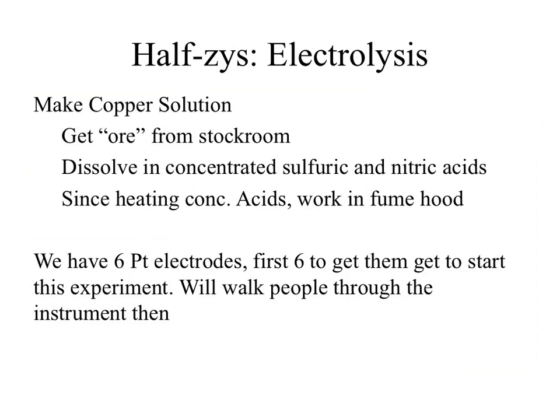These compounds will dissolve pretty much any organic material in there. We want to get rid of the organic materials because organic materials can react with the electrons in our electrolysis experiment. They can also change the absorbance. Okay? So we want to try and remove that organic material. These acids will dissolve it all so we don't have to worry about it. Okay? Pretty much remove all that color.